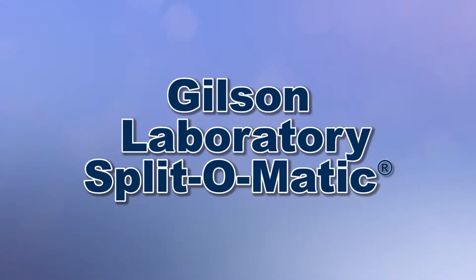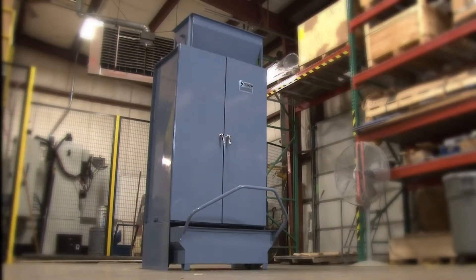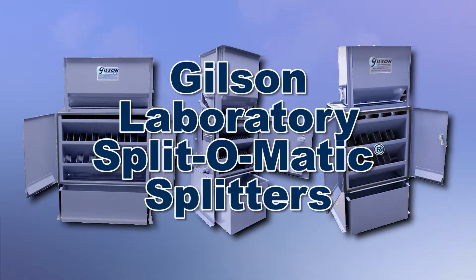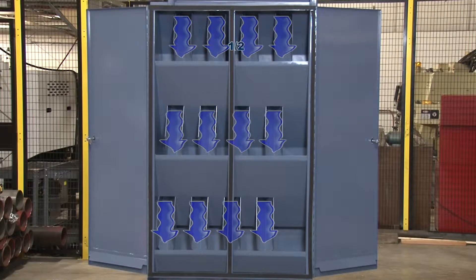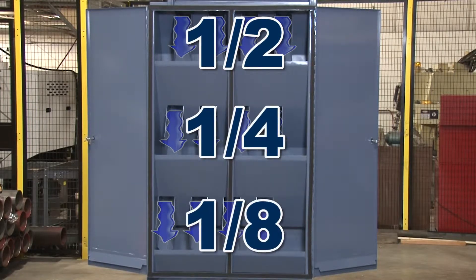When your laboratory requires large samples to be quickly and accurately reduced, then Gilson is your best choice. Gilson's Split-O-Matic splitters will process bulk samples of a wide range of granular material through an exclusive three-stage design into fractions of one-half, one-quarter, or one-eighth within a single pass.